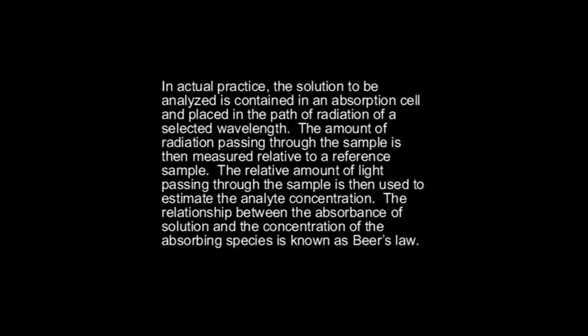In actual practice, the solution to be analyzed is contained in an absorption cell and placed in the path of radiation of a selected wavelength. The amount of radiation passing through the sample is then measured relative to a reference sample. The relative amount of light passing through the sample is then used to estimate the analyte concentration.